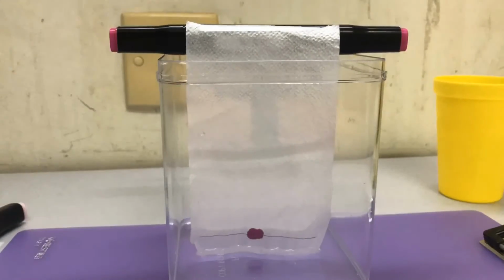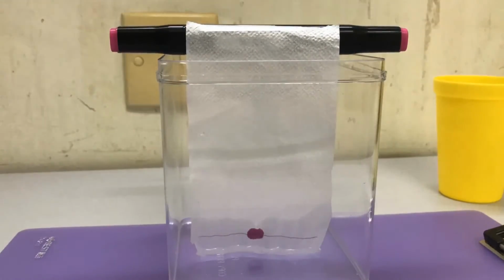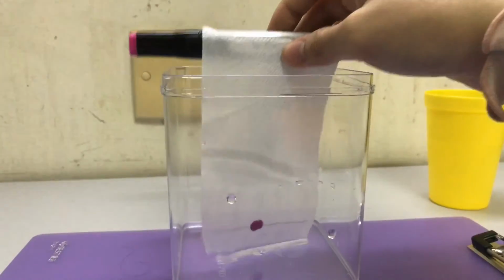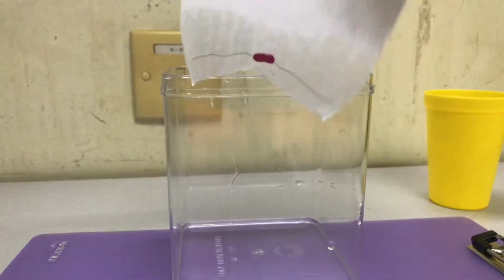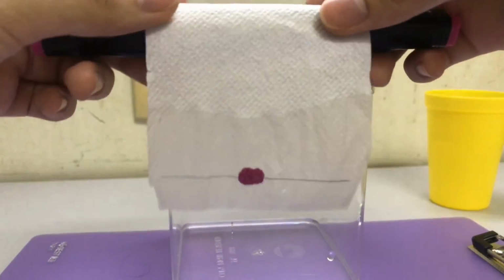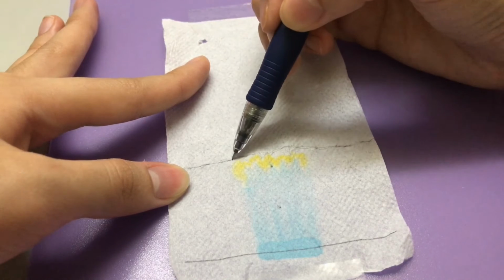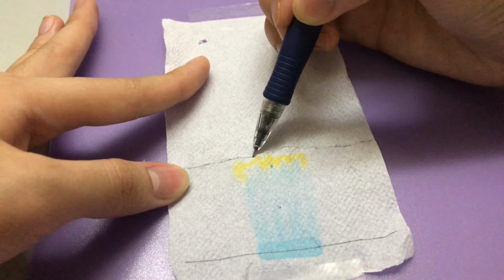So next is the Sharpie one. Because water is polar, because of the difference in electronegativity between hydrogen and oxygen, capillary action is greater in water due to its high polarity. Sharpie is a non-polar pigment. So a chemical that is very non-polar will not dissolve at all in a very polar solvent. Because of that, the Sharpie cannot dissolve in water that is polar.